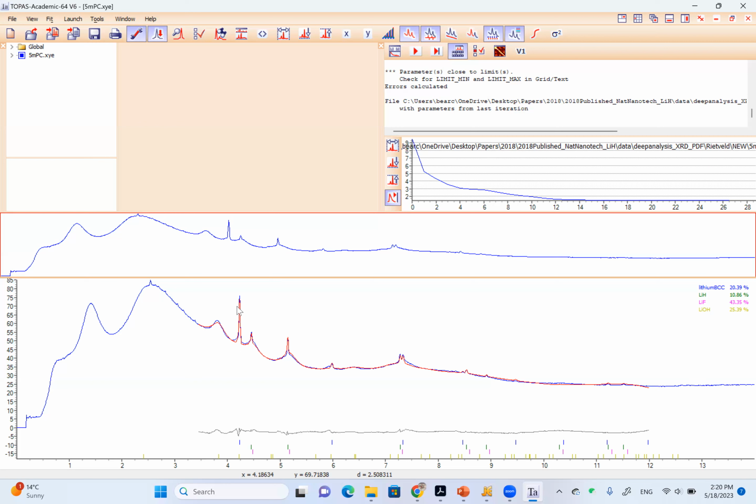But I think we have seen very nice progress in sample preparation. I believe more and more people in our group are capable of preparing interface samples for the environment. That's very important. That's step 1, right? So you need to collect samples that are dense and well sealed, well protected. And the second step is making measurements, and you should lift out all the filters, let them be fully exposed to the high flux beam, and you should expose for at least 5 or 10 minutes.